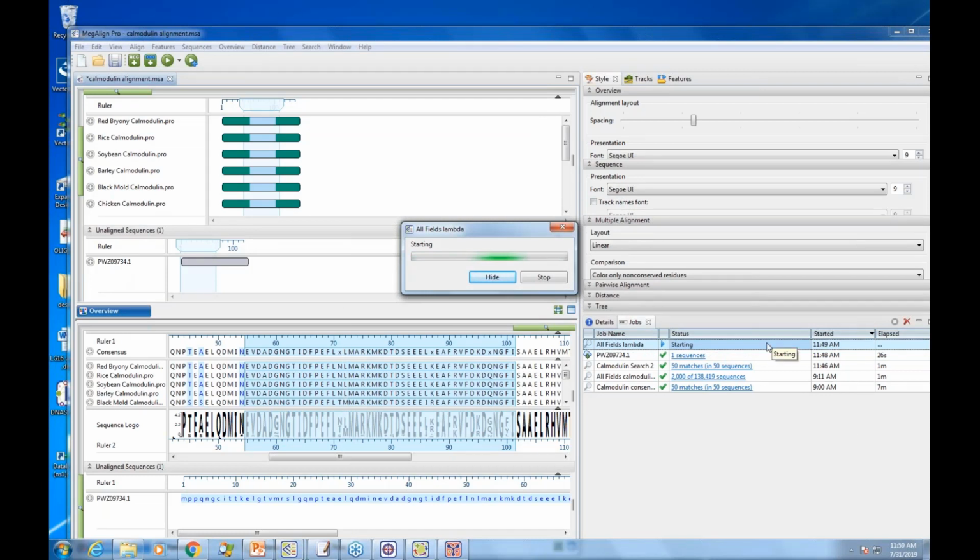This new search capability is in our newest applications, and you'll see it eventually added to SeqBuilder Pro, and some of our other applications, as we continue to get feedback from people. In all our new software, you'll see a little suggest feature. So again, we encourage everybody, if there's some piece of functionality that you can't find, let us know, and we'll do our best to add that.